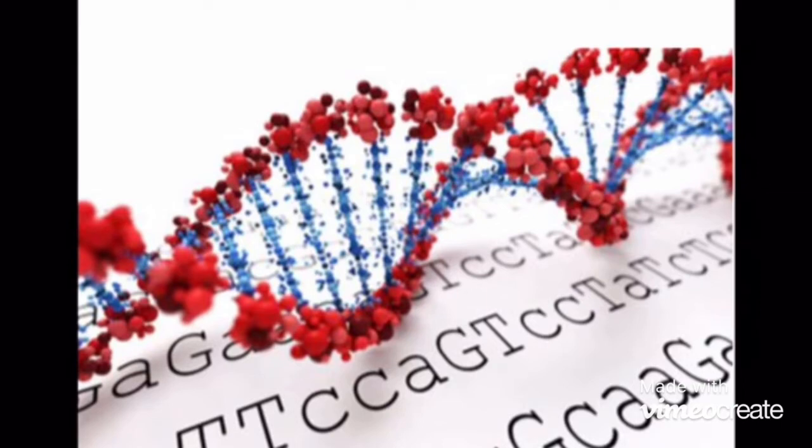And to do that, we do a technique called genotyping. It tells us the genetic makeup of the mice, and that allows us to see if the mice have NHEH protein. We can differentiate this gene by identifying if they are wild type or knockout. Wild type meaning that they do contain the NHEH protein, and knockout is that they don't contain the NHEH protein.